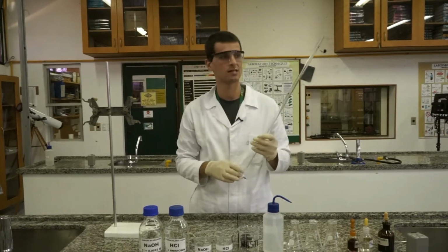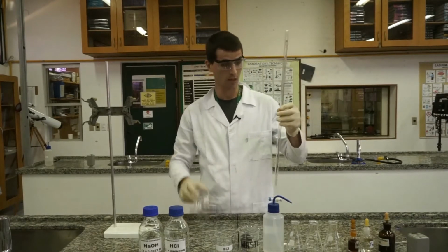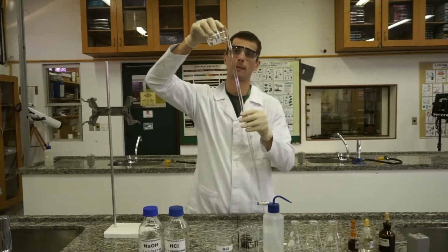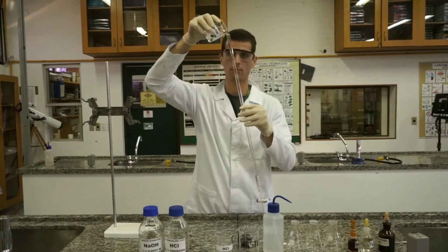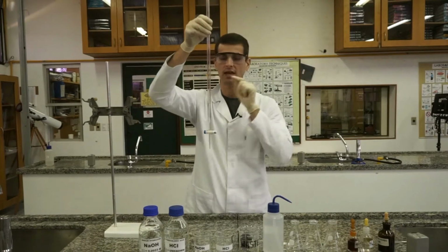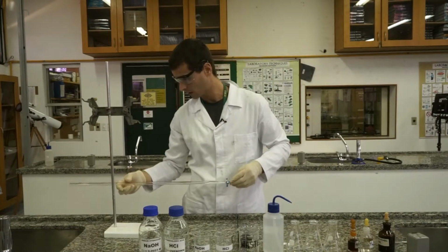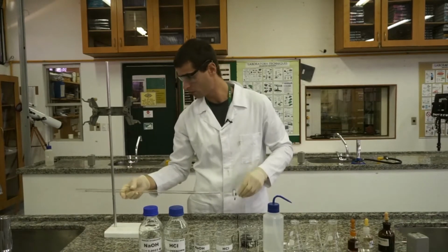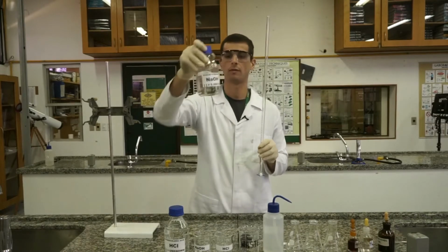But as I'm not sure how clean my burette is, I will rinse the burette with a little bit of sodium hydroxide to remove any impurities, moisture or acid that might be in here. In other words, I'm doing this to remove anything that can change the concentration of my TITRANT.